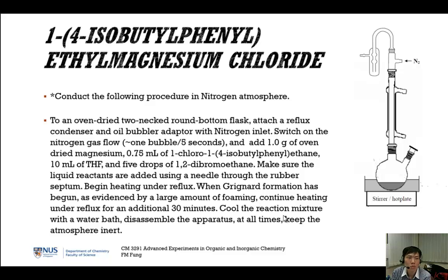After that, cool the reaction mixture using a water bath. Don't use an ice bath, okay? The glass will crack and then you just lose everything. I also can't help you in that. Disassemble the apparatus, okay? And still at this stage, you should keep the nitrogen gas on, okay, because we haven't used the Grignard reagents yet.